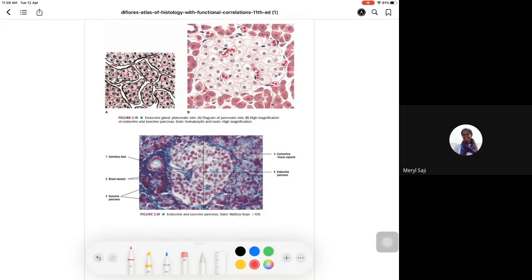If you don't see the islets, you will miss the pancreas as a parotid gland, because depending upon the anatomic location, we call it a different name. Pancreas is nothing but parotid gland plus islet cells, and these islet cells look like small round clusters with eosinophilic to clear cytoplasm, and they will have a lot of blood vessels.